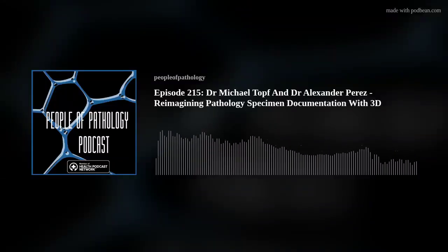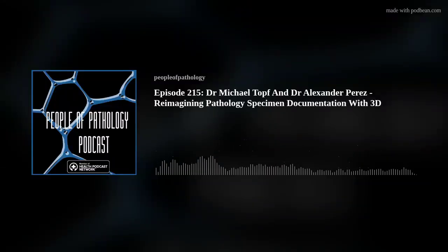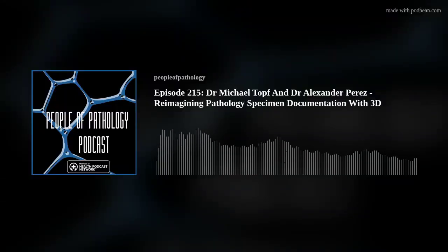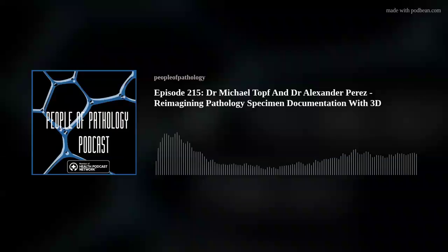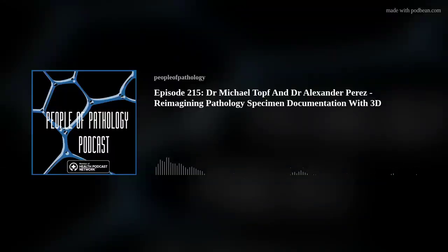The last thing I wanted to talk about is, because it's a new technology, I'm sure some people are thinking, okay, this is going to be very expensive and we won't be able to afford it. But you give the equipment that you use, you describe it in the paper. So I looked it up online just to see how much it costs, and it's around $2,000, a little bit more. So the price tag barrier is not really there for this. Could you comment on this? What would you say about labs that are hesitant to invest in this kind of technology?